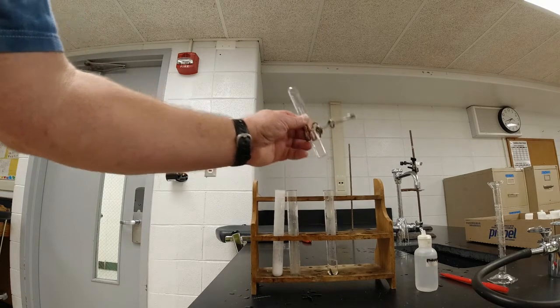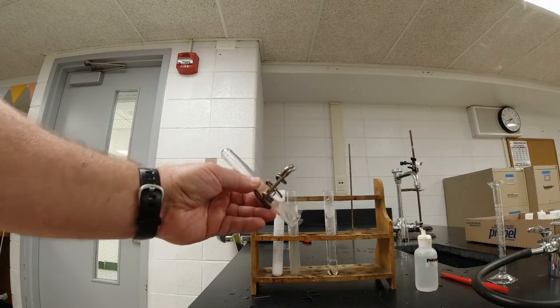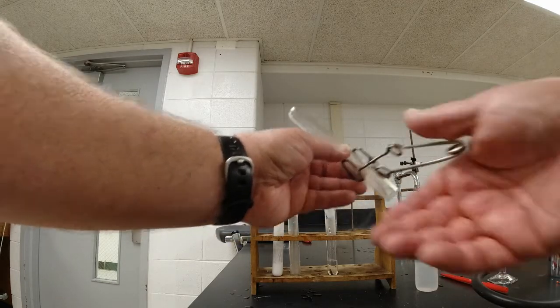All right, so I'm going to light my wood splint. I'm going to put it in the test tube. And then nothing happens, really. Write that down, that nothing happens with that one.